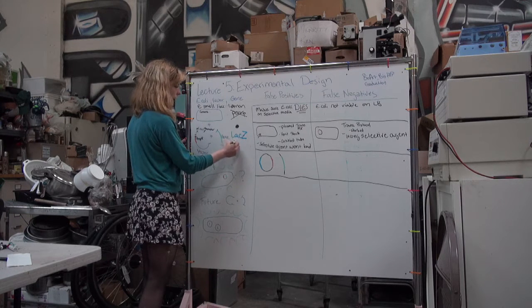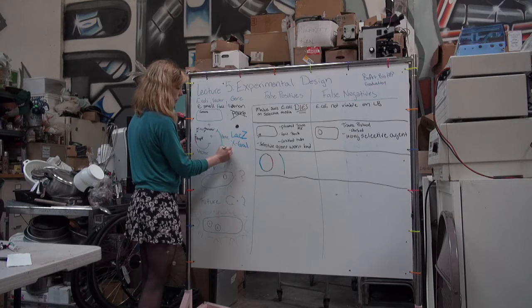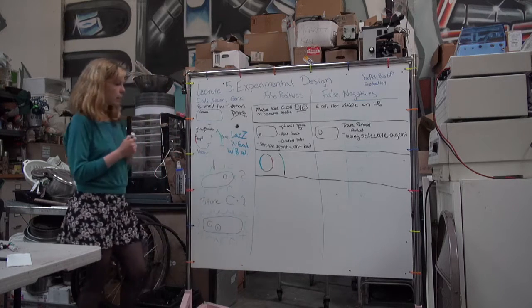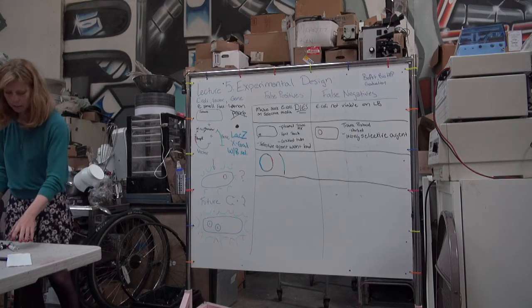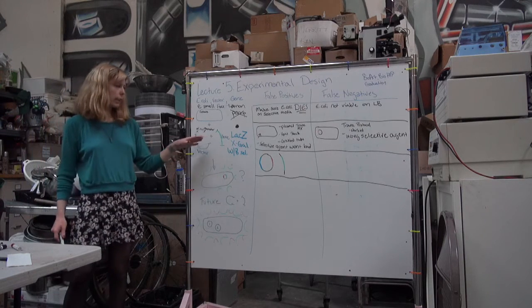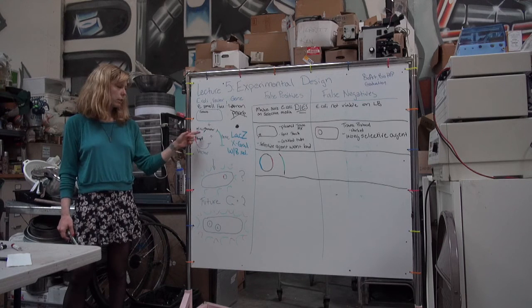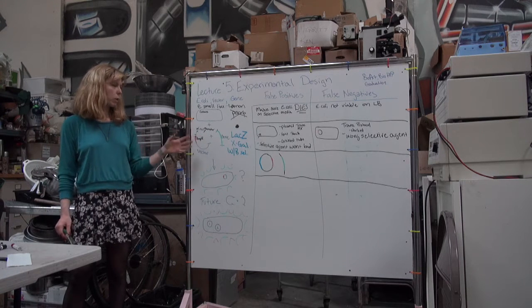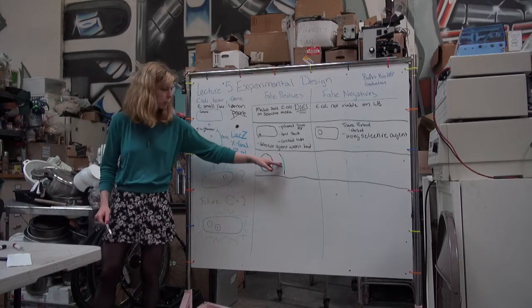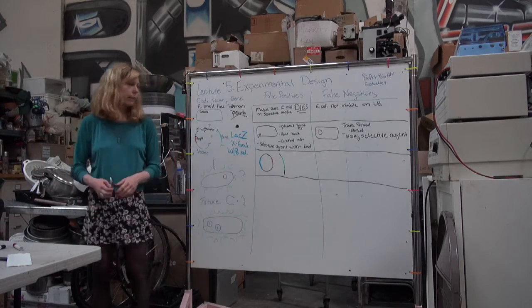Okay, I'm going to be using X-gal, it's blue-white selection. All right, so one of the ways I could find out that at least my gene got into the E. coli and was making more copies of it is probably just do a little switcheroonie between my gene of interest and the LacZ gene.